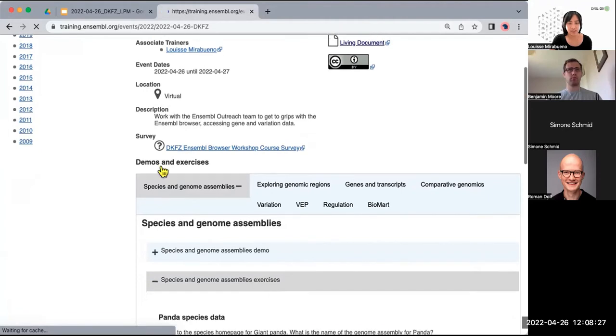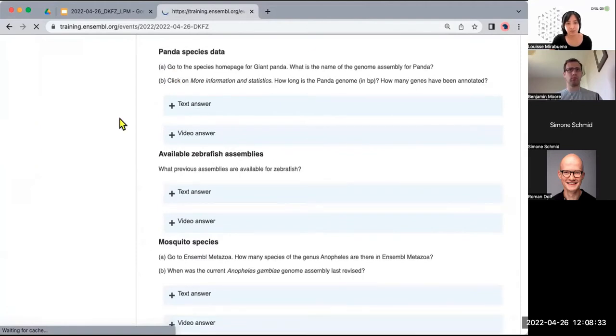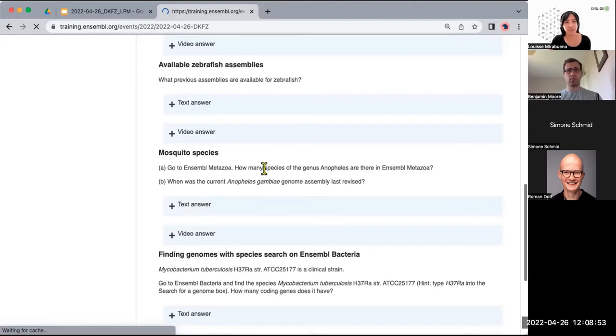There are several exercises per module, so if you're, for example, interested in mosquito, feel free to only answer the mosquito question. There are text answers here, so I'm not going to click that because it'll show up. But if you're stuck, you can look at the text answer or the video answer, or you can also just ask us on Zoom or the living document.